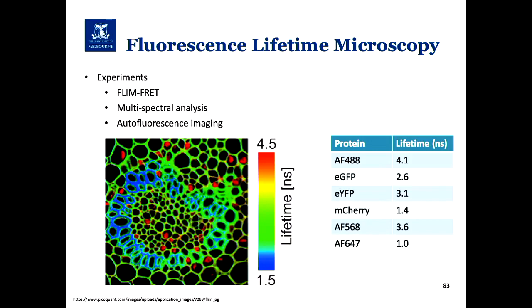And if you remember from the introduction to fluorescence, the lifetime is how long your fluorophore stays in that excited state before it returns back to the ground state. So one of the nice things is proteins or fluorophores, which are very, very similar in terms of emission wavelengths, can have very different fluorescence lifetimes.